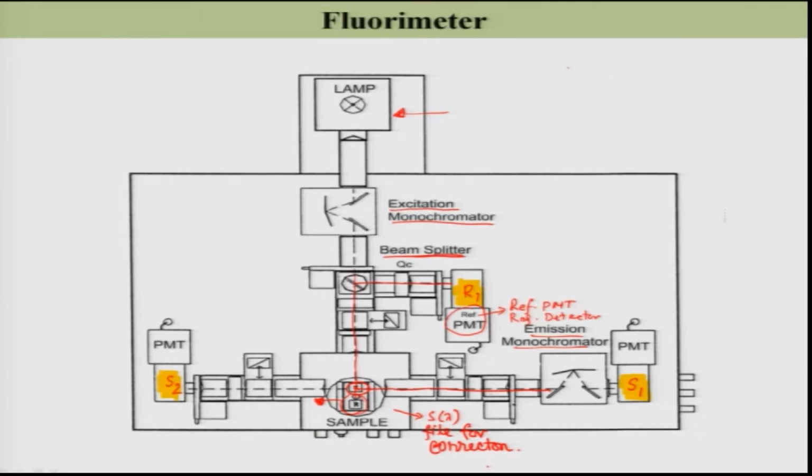So, what you can do? You can measure the intensity at S1 plotted versus lambda emission.